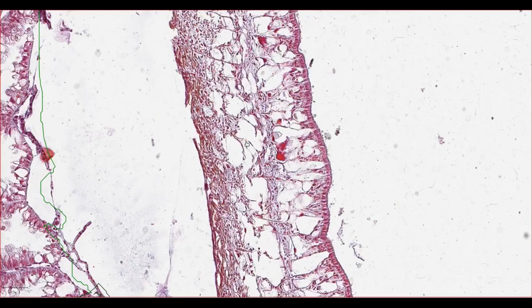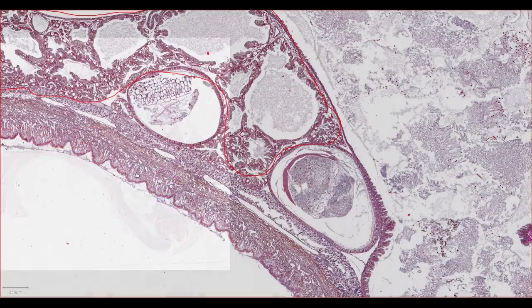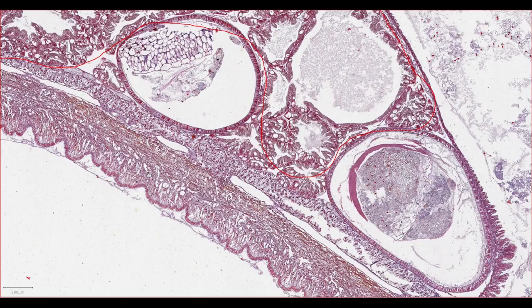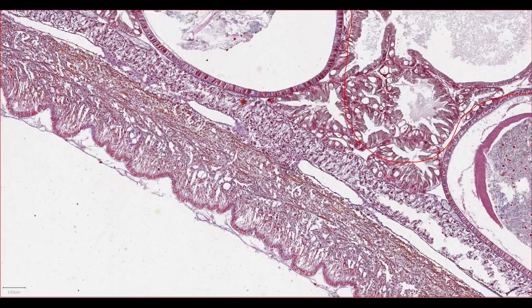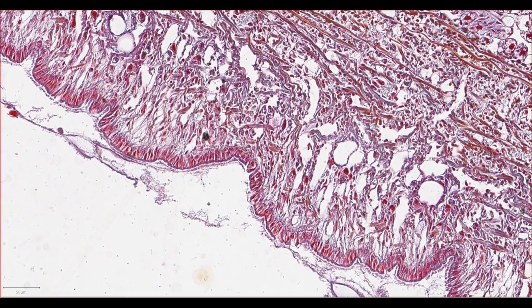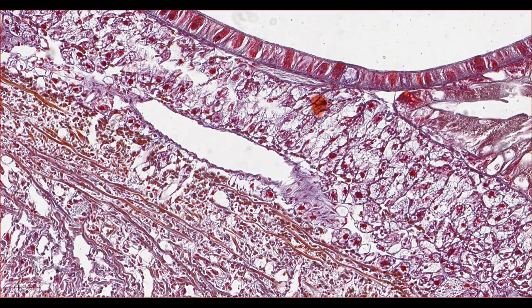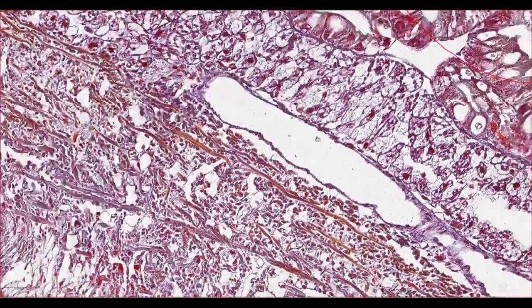And then below the mucus-filled cells, there's a thin muscle layer. The composition of snail's skin changes depending on which part of the body you're looking at. If we look at the ventral aspect of the snail, the part that would be in contact with the ground, we can see that there are much fewer mucus cells below the epidermis. And there's a thicker muscular layer with different orientation of the muscle fibres. And below that, there's a secretory gland, which extends all the way along the snail's ventrum.